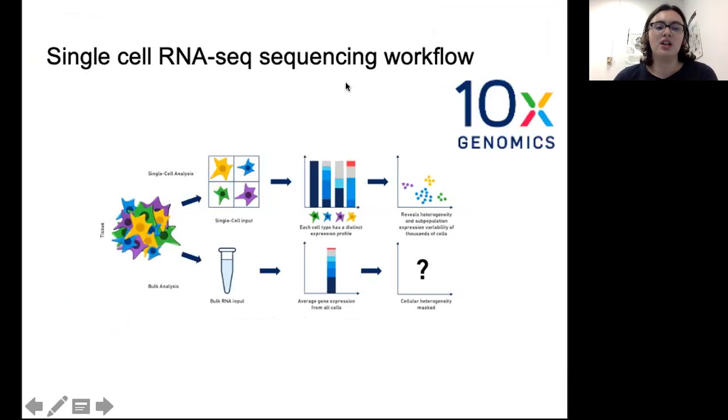So single-cell RNA-seq gives us the ability to sort or cluster cells based on the genes they express, so we can classify them as more or less similar to their cell types and identify these clusters based on the markers. And then we had about 2,400 cells from 4 samples, and after quality control, we ended up with about 1,700 cells because we exclude cells that express low levels of RNA or very few genes because these cells may be dying.